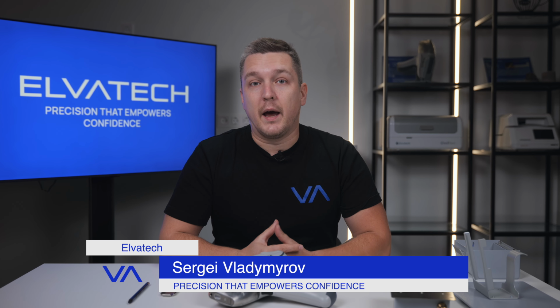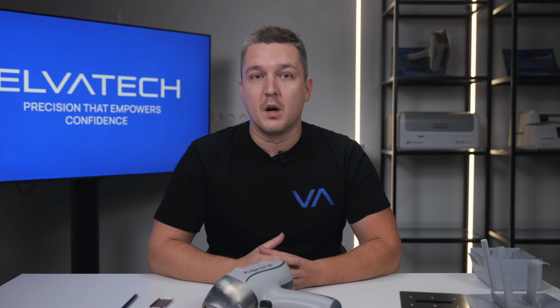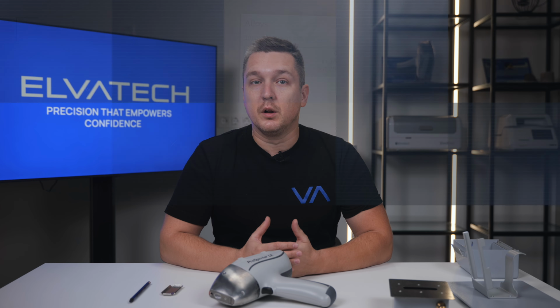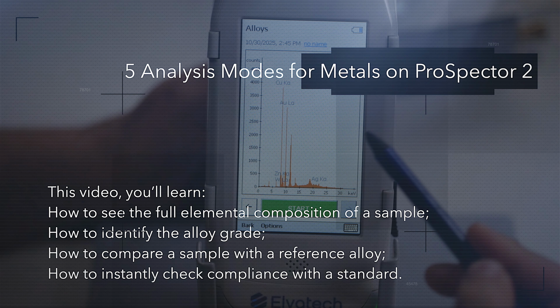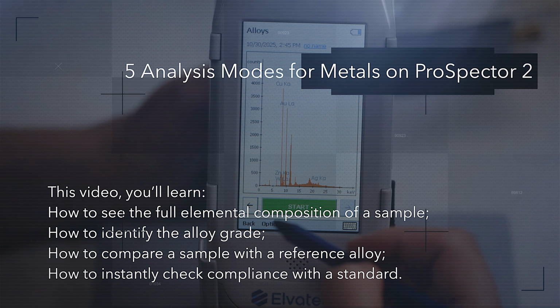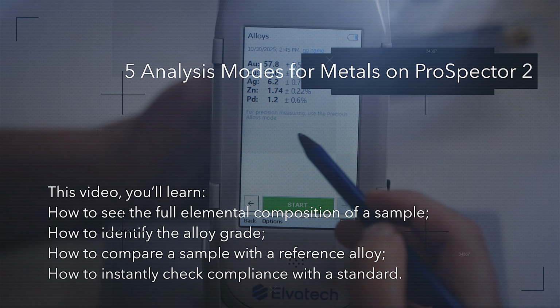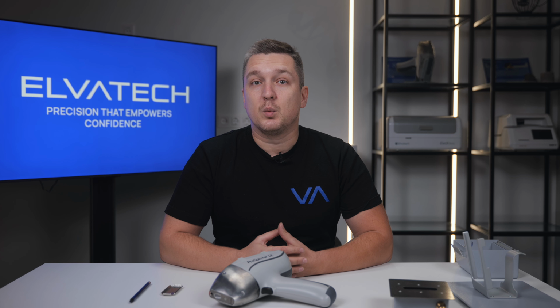My name is Serg and today we will look at 5 analysis modes for metals and alloys on the ProSpector 2 analyzer. In this video you will learn how to see the full elemental composition of a sample, how to identify the alloy grade, how to compare a sample with the reference alloy, how to instantly check compliance with the standard. Next, we will go through each of these modes in detail.